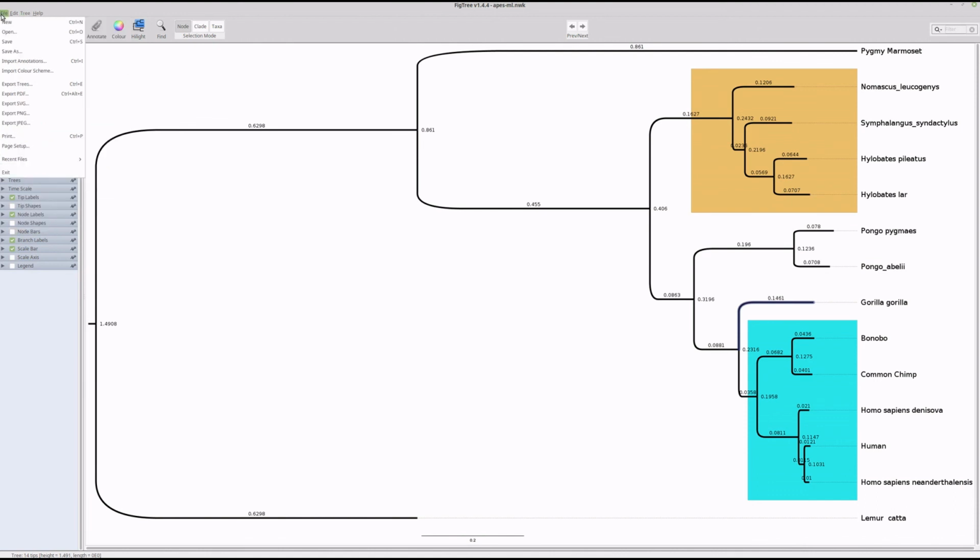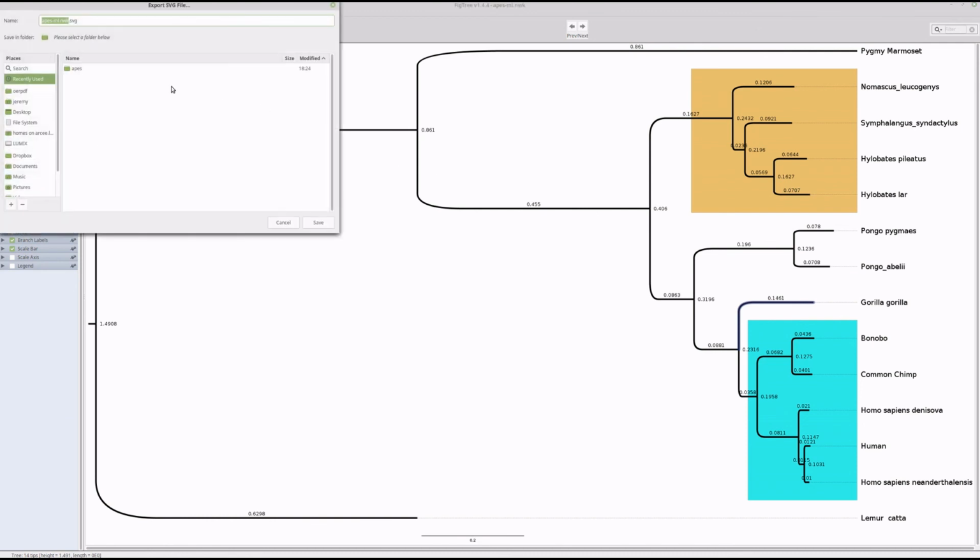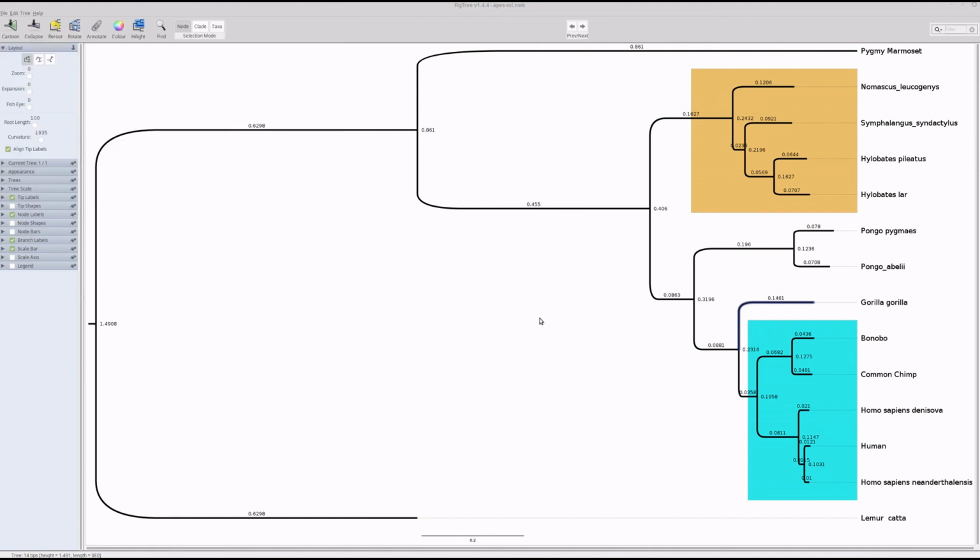And otherwise, what you can also do is export them to various graphical standards. So I'm going to export this as an SVG because that is a very useful file format for dealing with curved lines and text and colorations, so that things can be stretched out and read properly. So that's the very useful thing that we can do with this sort of software that we have in front of us, right?